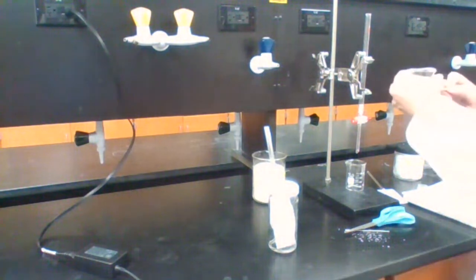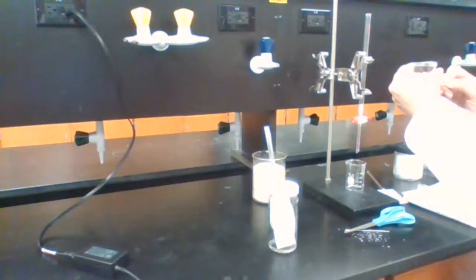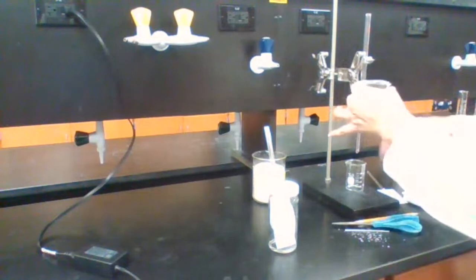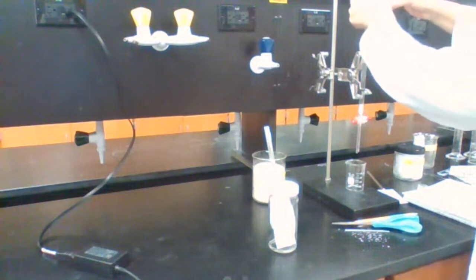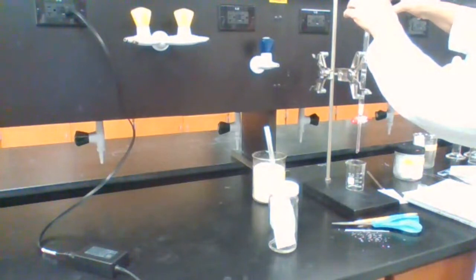I'm going to label my beaker with the hexane because all of these chemicals or solvents that we have have the same color, and I don't want to get mixed up. I fill up 2/3 of the column with hexane.